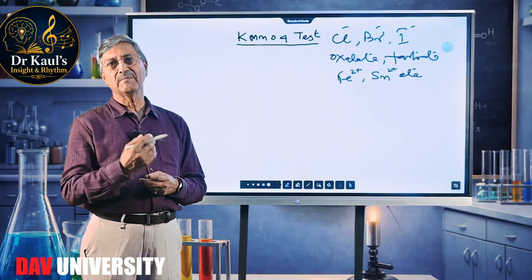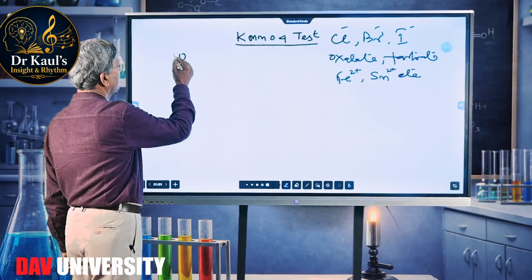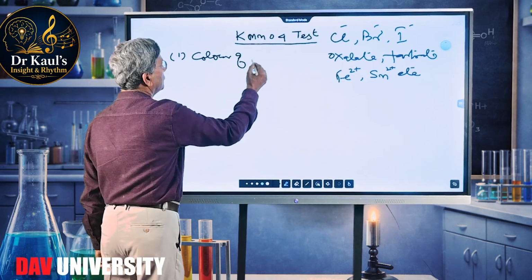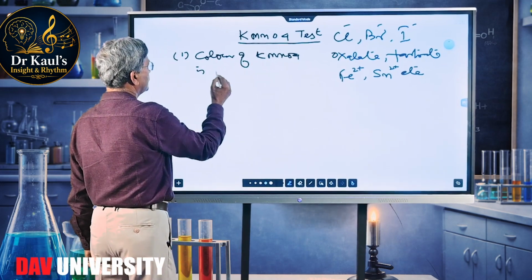Now, there could be the following observations. Number one, the color of KMnO₄ is discharged.